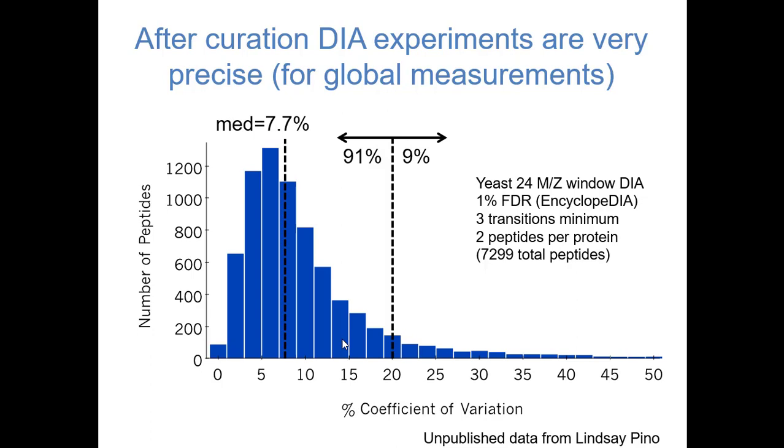That said, DIA actually does enable us to do high-N replicates, which I think is the beauty of DIA as compared to DDA. So with DDA, if you acquire like 10 replicates of a sample, you end up sampling different parts of the proteome one day versus the next. That said, a 10 injection pool is really hard to do with TMT, which is another strategy for doing quantitation.